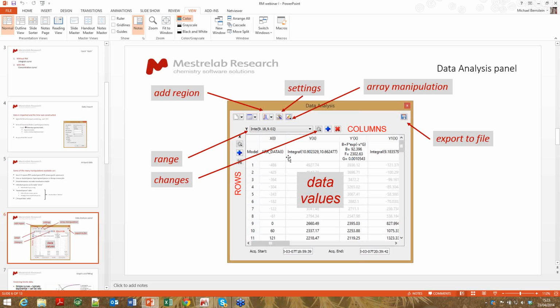And these work in this way. So the X column is the time dimension, or the time column if you like. Here you can see that array vector number 9 is set to time equals 0, and normally that would be at the top. These are the data values. So for the first region that I selected, called yx, these are the numbers for it, in this case in integral units, as you can see from there.